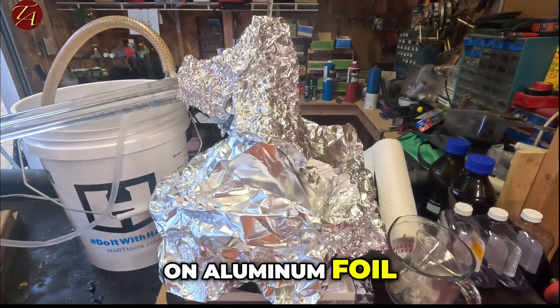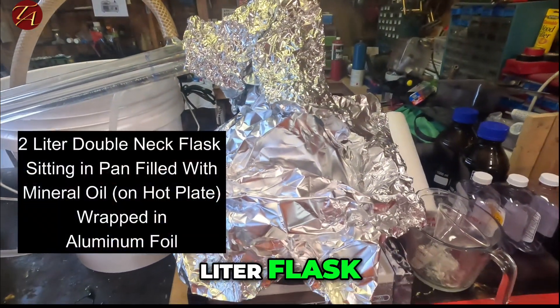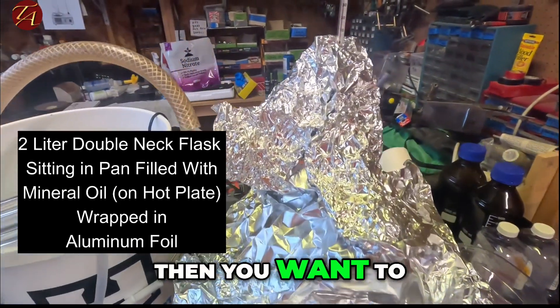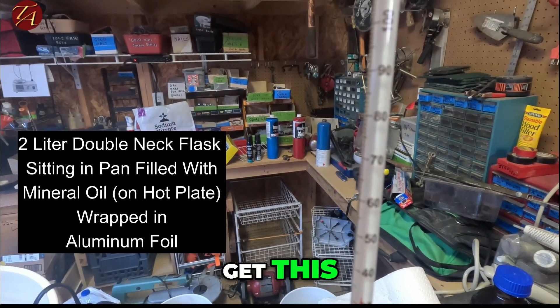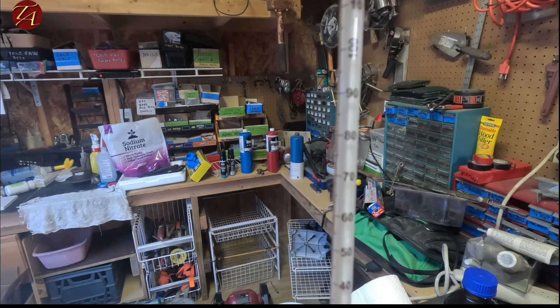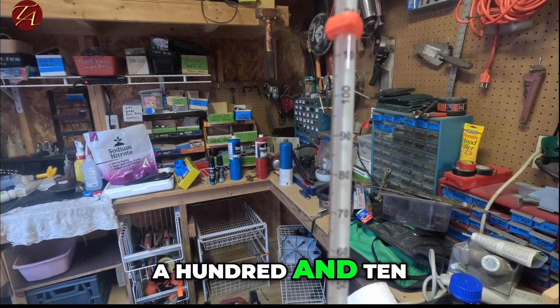On the aluminum foil, I just have a tent around the two-liter flask. You don't want to wrap it too tightly, and you want to wrap the joint up here so that it keeps the heat in. Our goal is to get this up to about 110 degrees C — that's about perfect.